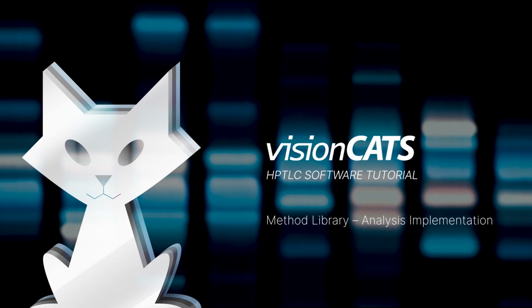The method collection includes more than 300 individual HPTLC methods for the identification of herbal drugs, preparations, substance classes, and complex mixtures. All methods follow the association's HPTLC standard operating procedure and are referenced or adapted in major pharmacopoeias worldwide.